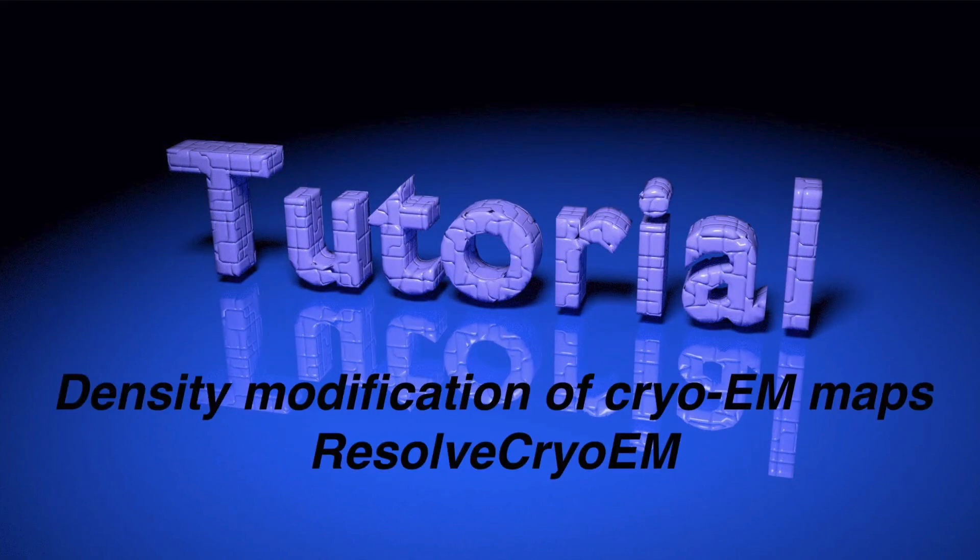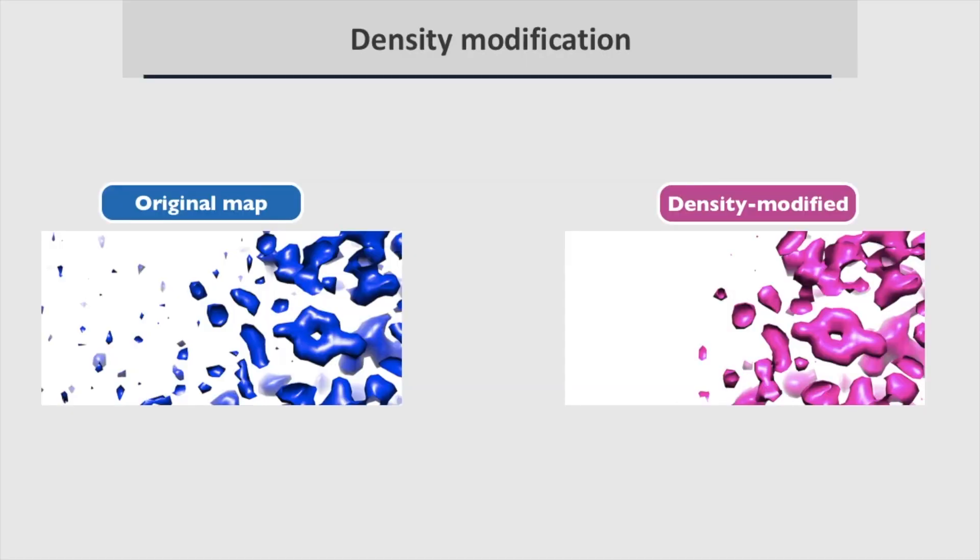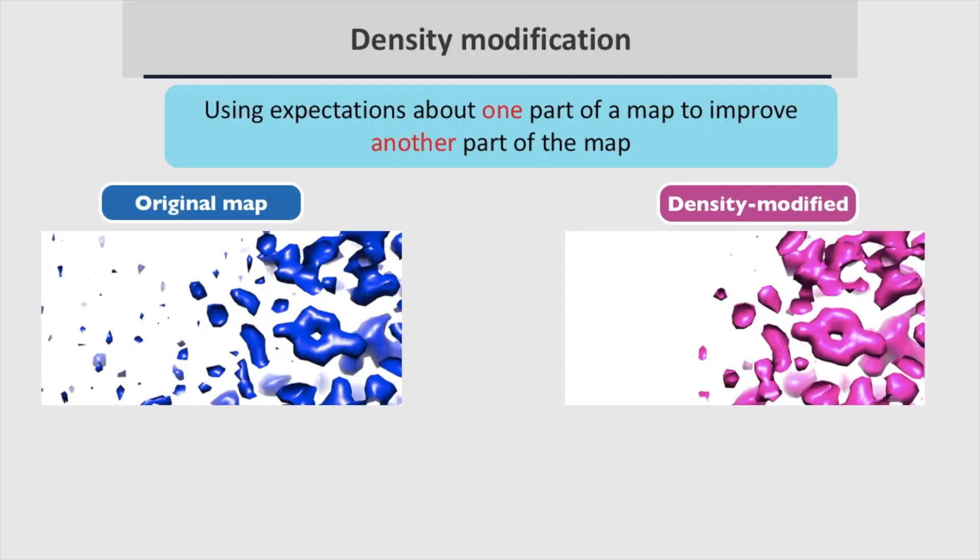Today we are going to learn about density modification of Cryo-EM maps using Resolve Cryo-EM in the Phoenix GUI. Density modification uses expectations about one part of a map to improve another part of the map.